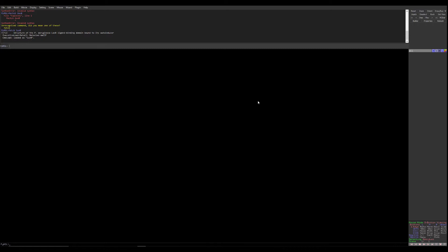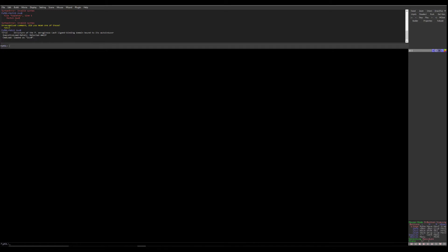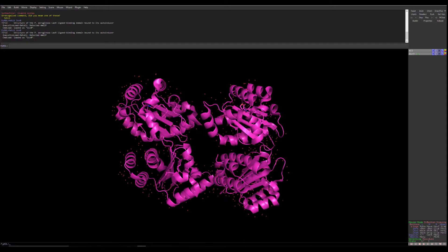You should know how to work with scenes and how to store scenes. To import the protein structure, we already know we can use the FETCH command. With the four-letter code we can fetch the particular protein directly into the PyMOL window. We're going to write FETCH space followed by the four-letter code of the protein, which is 2UV0. Press ENTER and you can see the structure of Pseudomonas aeruginosa LasR ligand binding domain bound to its auto-inducer in tetrameric form.